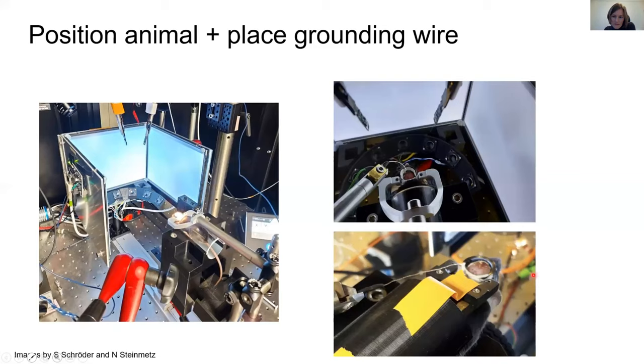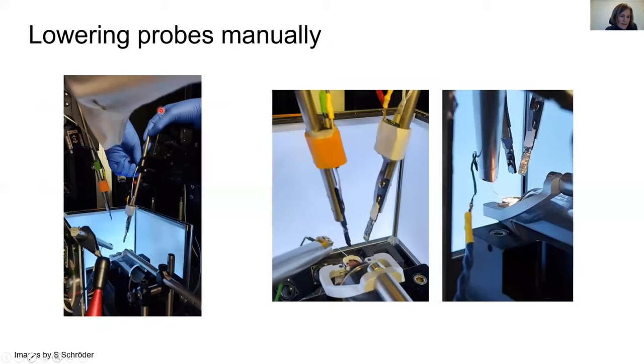Then you lower the probes manually, so just before we had fixed them, but they were too far away from the brain, so now you really lower them so that the tip of the electrodes is less than two centimeters away from the brain. This is just a view of how this should look like after that step.